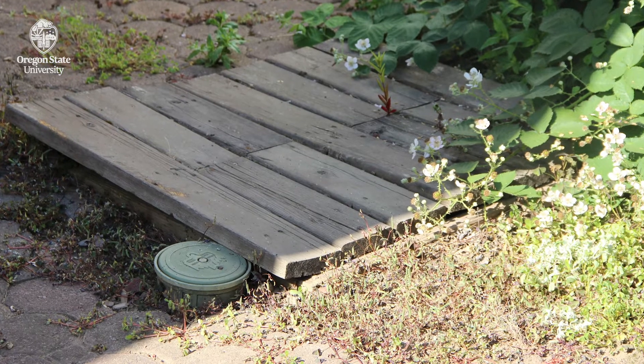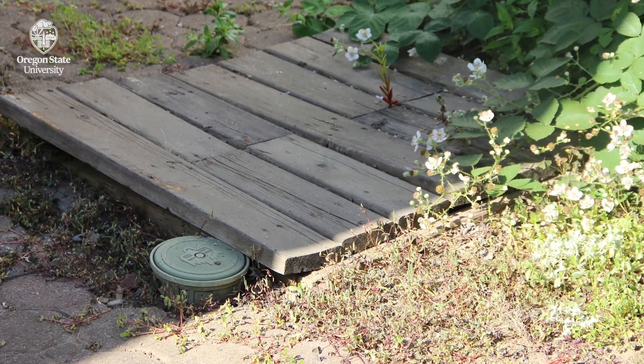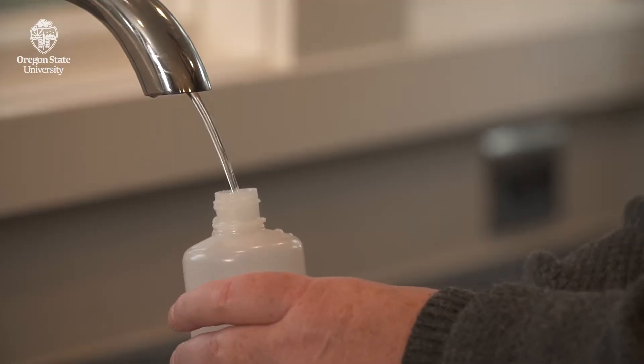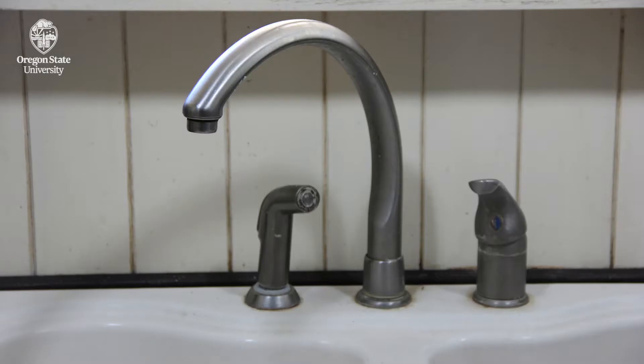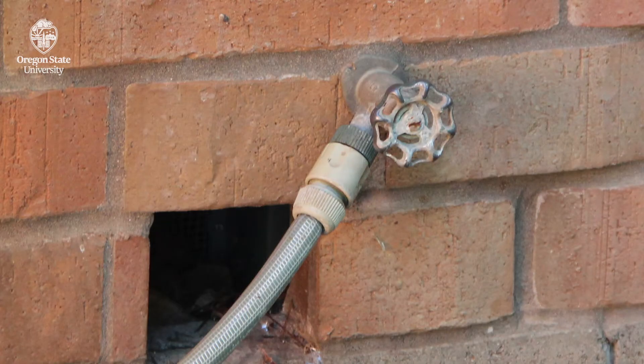If you can easily do so, take a sample of water from the well head. If you can't easily access your well head, take your water sample from a faucet, like the kitchen faucet. Try to avoid swivel-style faucets or outdoor faucets.